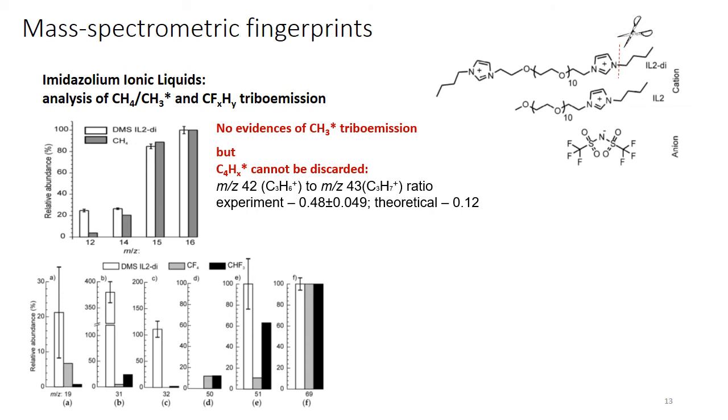And you can see here that the experimental data do not correspond exactly to any of these compounds, but there is closer correspondence to CHF3, for example, in this case with the mass 51, which means that in contrast to the general belief that there is emission of CF3 and formation of CF4, there is a bond breaking between carbon and sulfur, and this CF3 free radical then abstracts hydrogen from the environment, from somewhere, and then forms CHF3, which is then ionized in the spectrometer, and then gives us this spectrum which we can analyze.